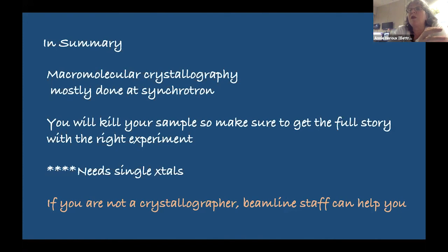Those decisions you will have to make every 10 minutes, because this is how long it takes to move from one sample to the other. So we have lots of software available, and sometimes it can be overwhelming because there's a lot of choices and decisions to make. One of the big limitations is to have a single crystal.